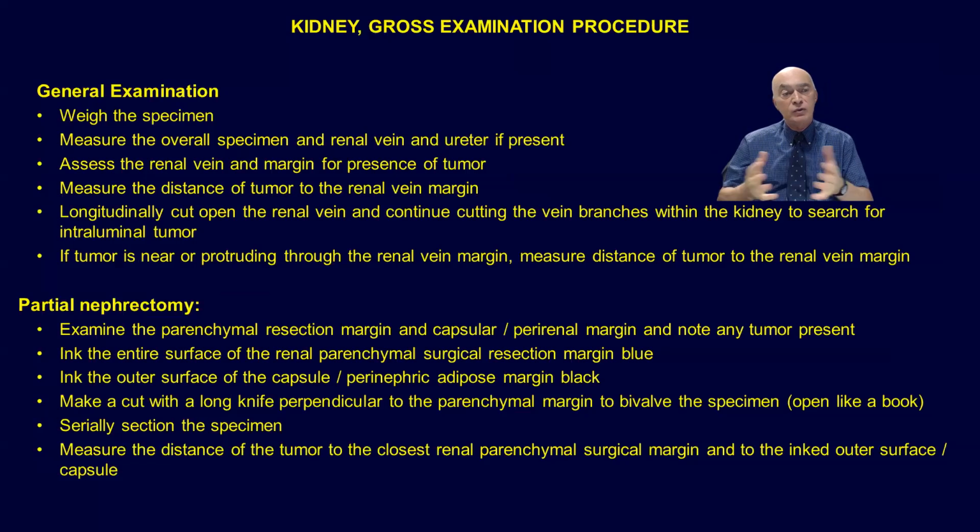So when we describe these specimens, we always need to remember that the ureter has to have a particular handling as an individual organ. And also at the moment of diagnosis, we need to put kidney and ureter radical nephroureterectomy, and then as subtitles the kidney and the diagnosis of the kidney, and the ureter and the diagnosis of the ureter, even if the ureter doesn't have any pathology. But in many cases, the ureter also has tumor.